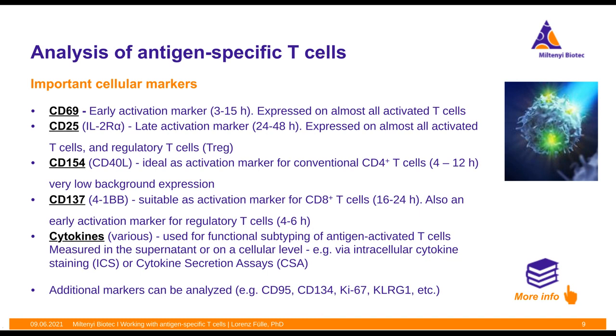Then we have CD154, also known as CD40 ligand, which is really an ideal activation marker to analyze conventional CD4 positive T cells after about 4 to 12 hours of stimulation.